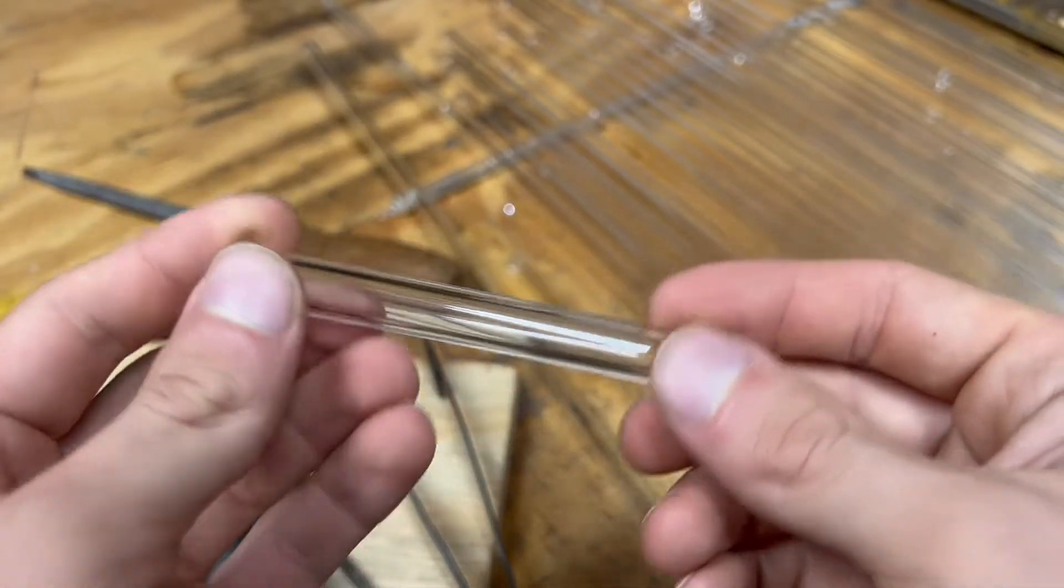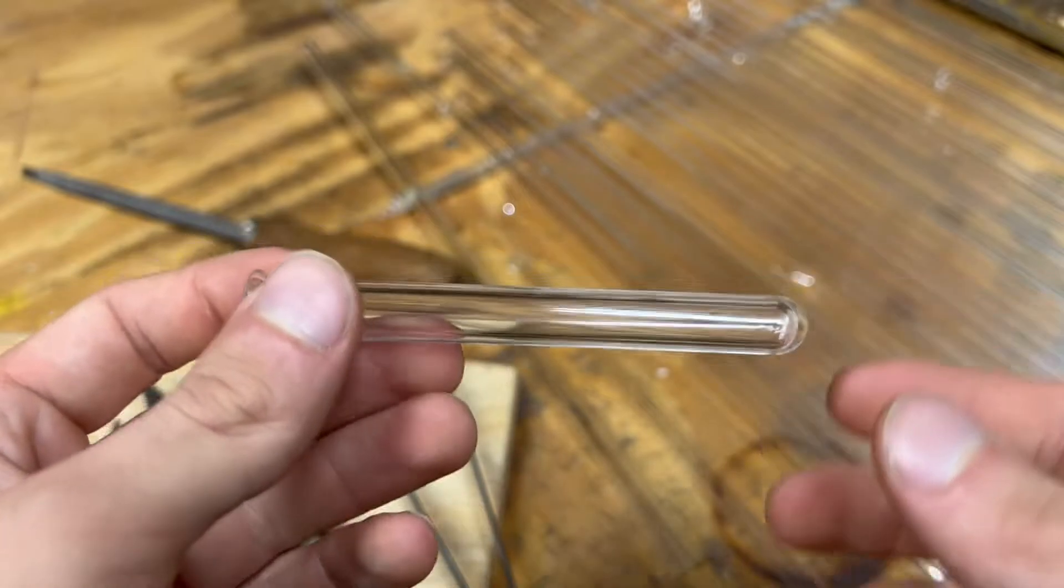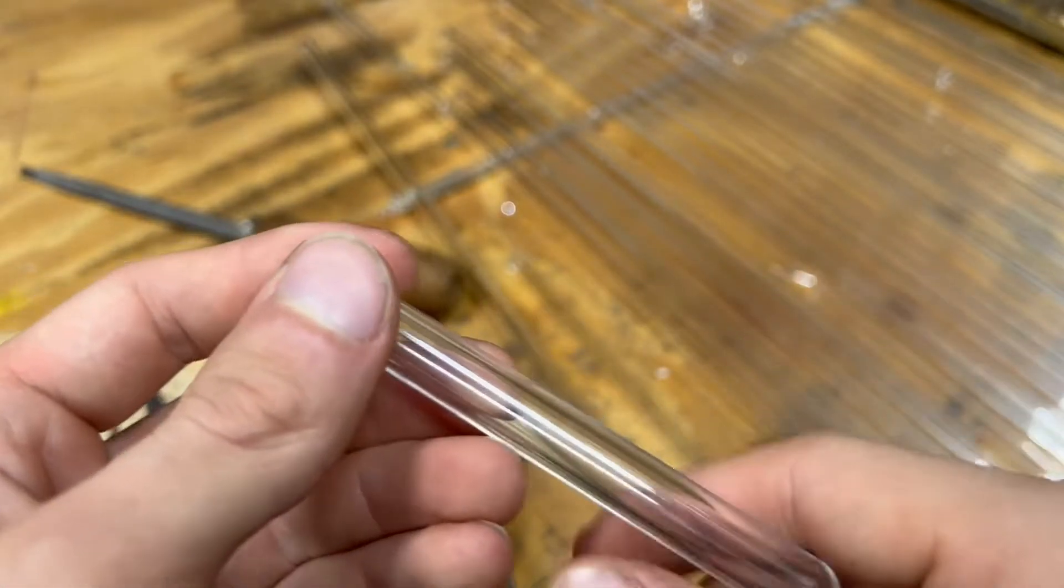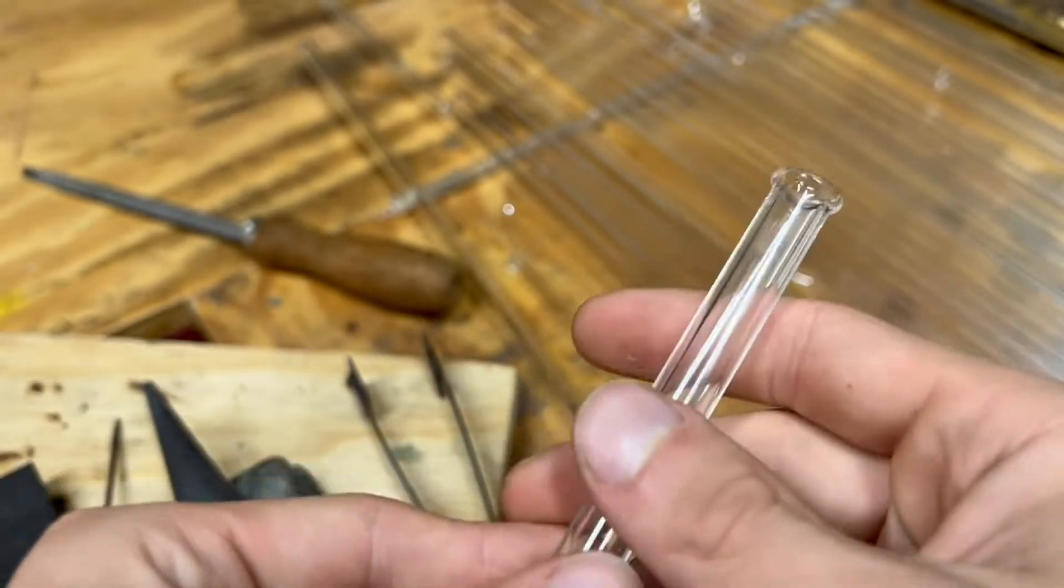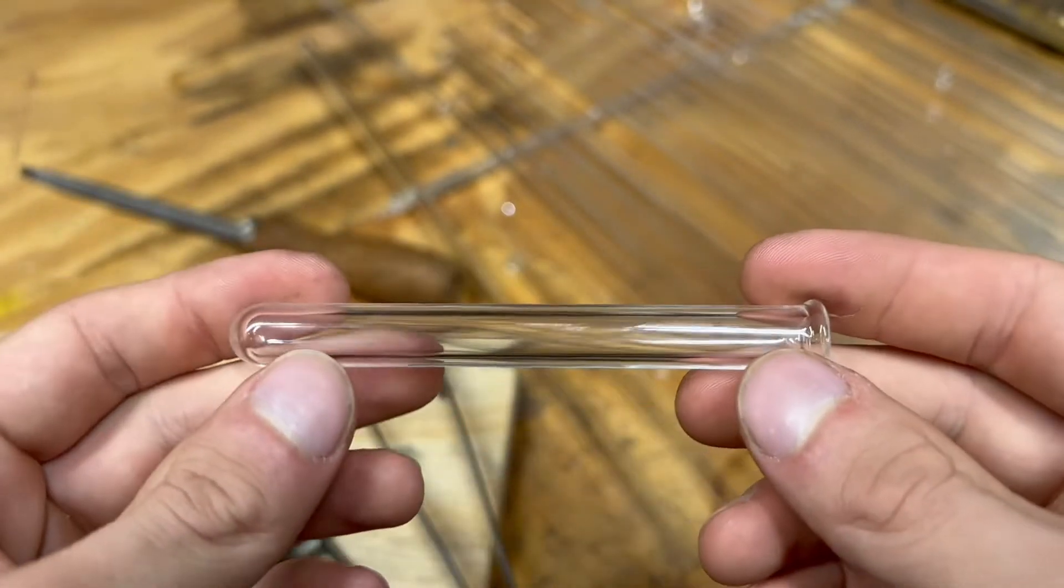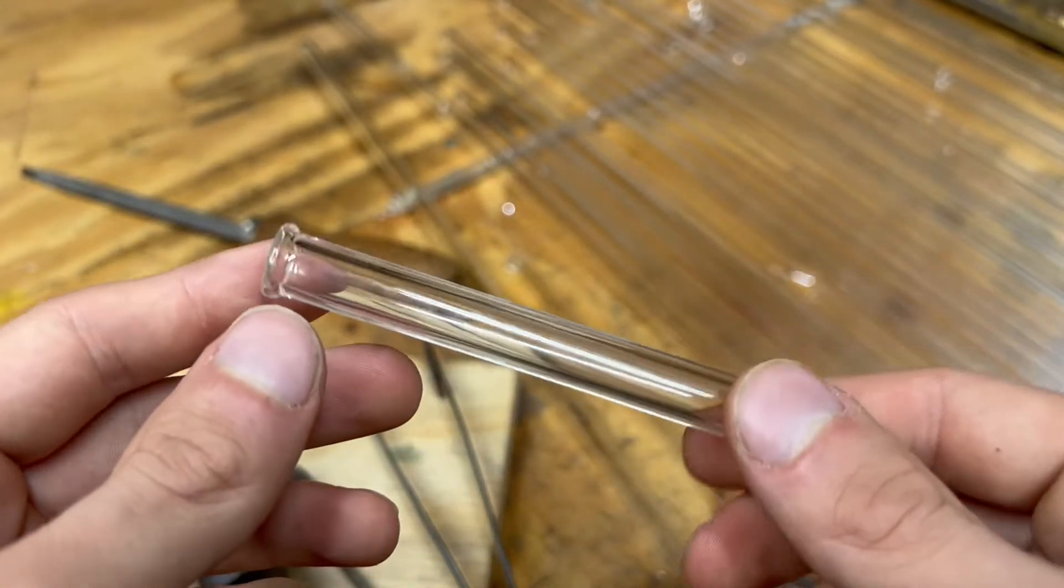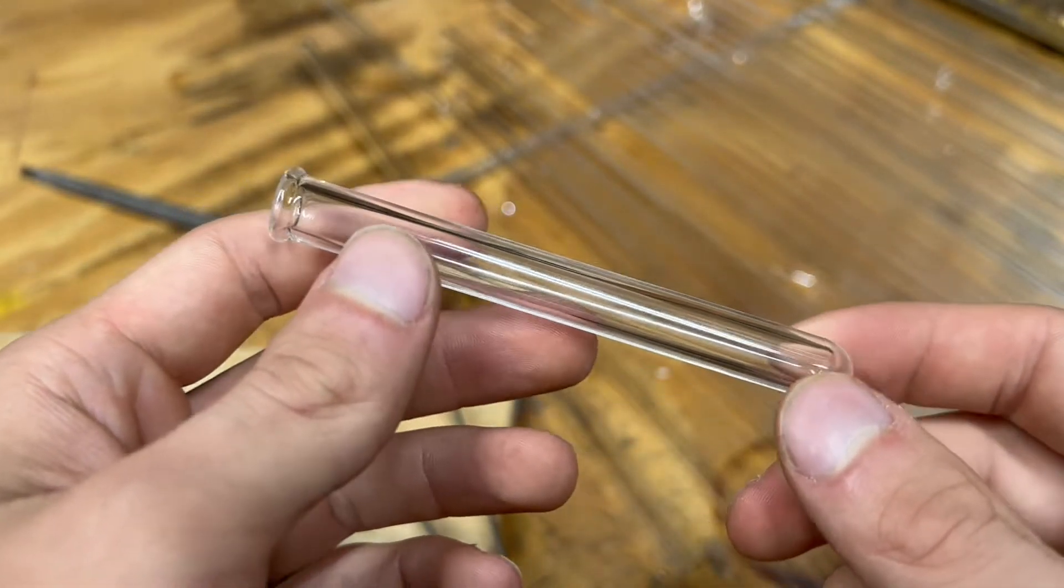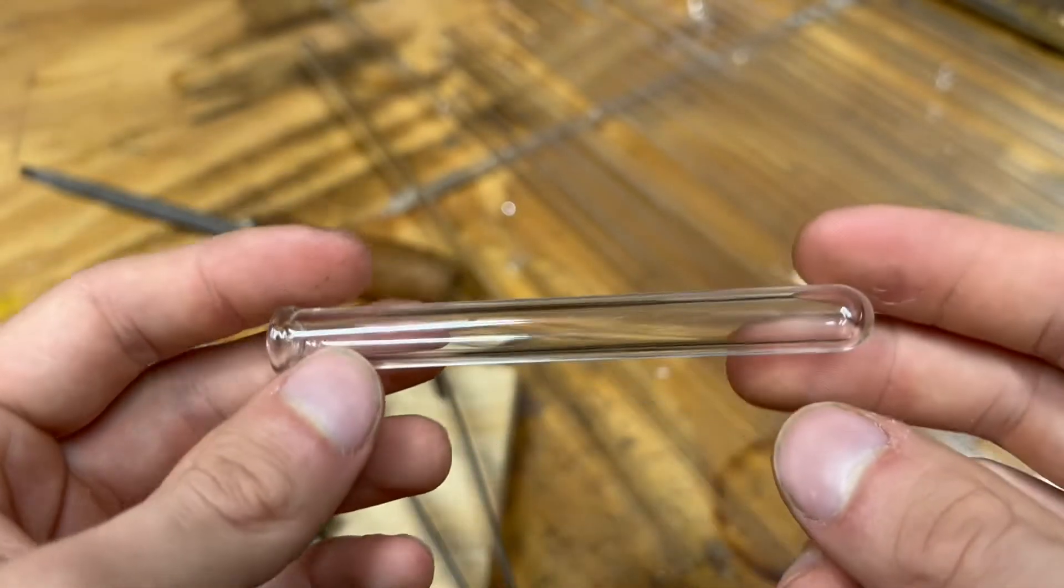The test tube is found in any place where science is conducted. It's synonymous with science itself. Any movie trying to depict science has test tubes somewhere in the video. It's a versatile piece of equipment that has many uses and without it, the field of science would not be what it is today.